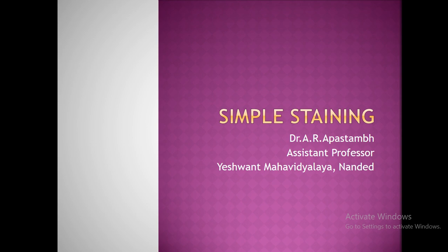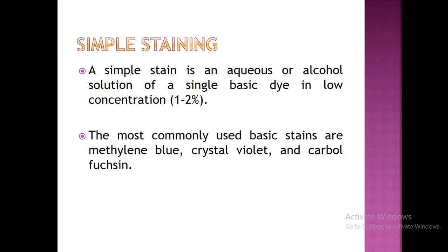There are different methods of staining in microbiology, out of which we will discuss one technique. It is called simple staining. So let us discuss in detail what the simple staining technique is.